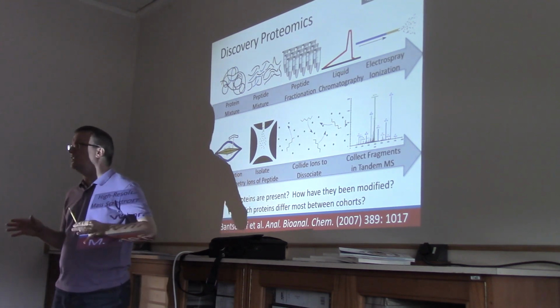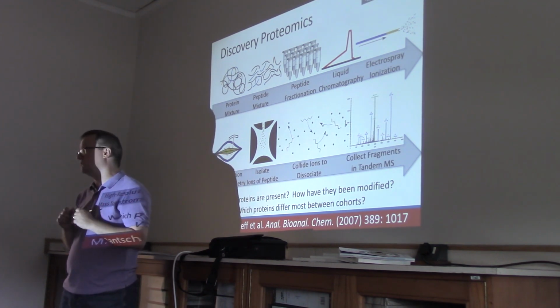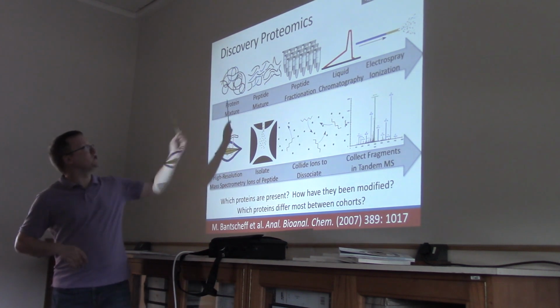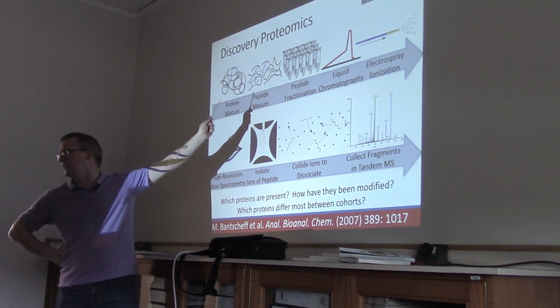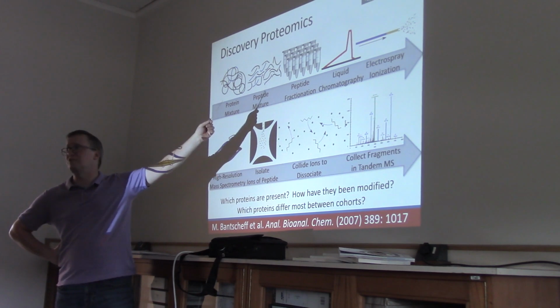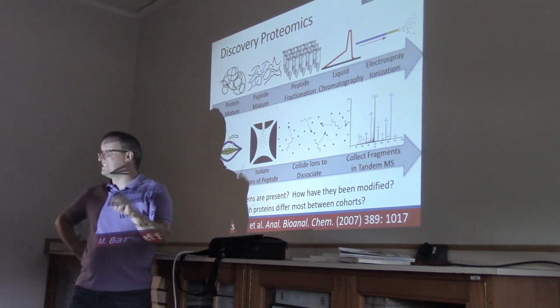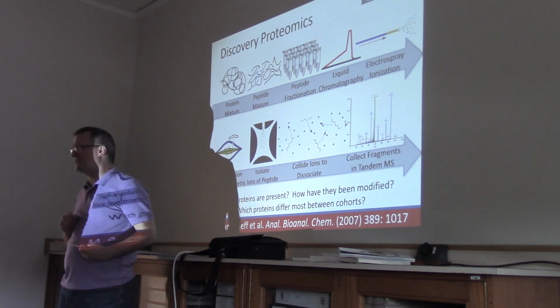In something like a cell line, though, you could typically see many thousands of proteins, more than 10,000 proteins, in fact. So, in general, this peptide mixture may contain, let's say you've got 10 times as many peptides as you started with proteins. So you could have more than 100,000 peptides in these peptide mixtures. As I said, we frequently trade use of instrument time to get better sensitivity.